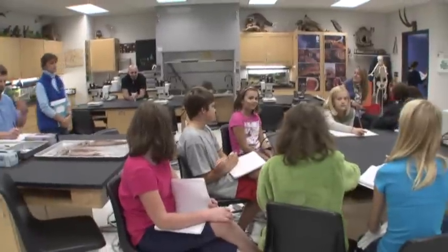So you looked at the dissections and they are squid and the clam, right? So I got a lot of stories. And I have my helpers here today. I have Courtney over here, former student, and Brad, a current student, and they're going to help with the actual microscopes and preparing some of the dissections for you.